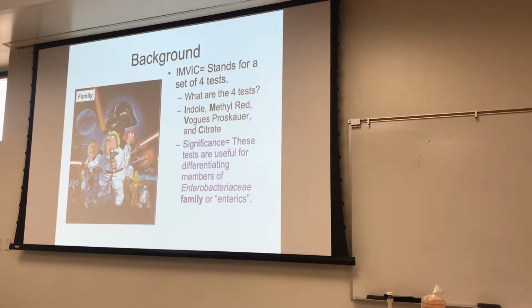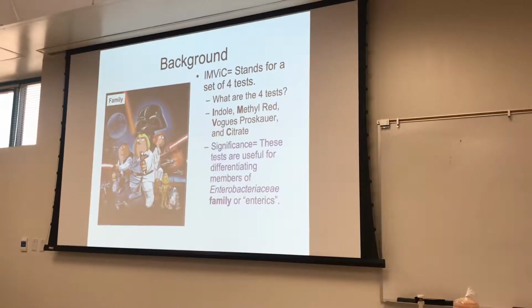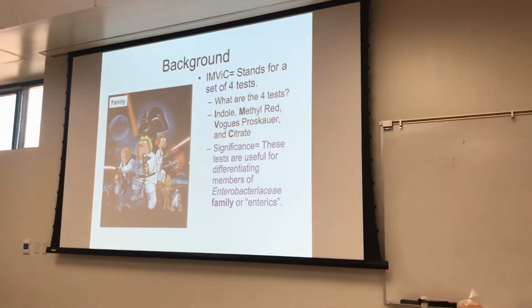And it's going to help you a lot. If you're thinking that you're in the Enterobacteriaceae family, so if it looks like you're going in that direction, then the IMViC is going to allow you to distinguish all the members from each other.